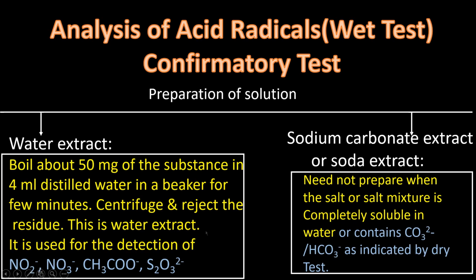Now coming to the sodium carbonate extract. I am going to tell the preparation of sodium carbonate extract in the next slide. Remember, we prepare the sodium carbonate extract to take the ions or acid radicals or anions to the solution state for doing the confirmatory test. If your salt or salt mixture is completely soluble in water, then you can prepare the solution in water only, that is aqueous solution.